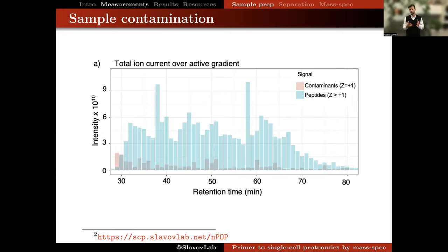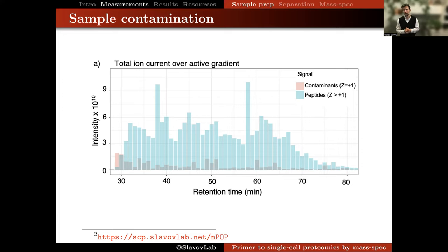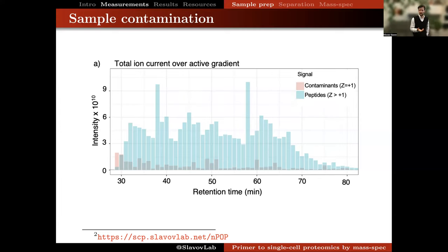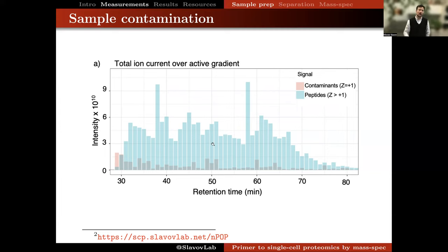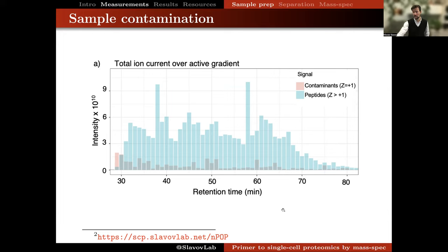Another aspect related to low background and analysis cleanliness is suppressing singly charged ions that are usually not peptides and can compromise peptide analysis quality. This can be done by using mass spec-compatible reagents and minimizing sample preparation volumes. An example shows the total ion current for singly charged ions (in pink) and multiply charged ions—likely peptides—in cyan. The ion current from peptides is substantially larger than from likely contaminants during the active gradient, which is the desirable situation.